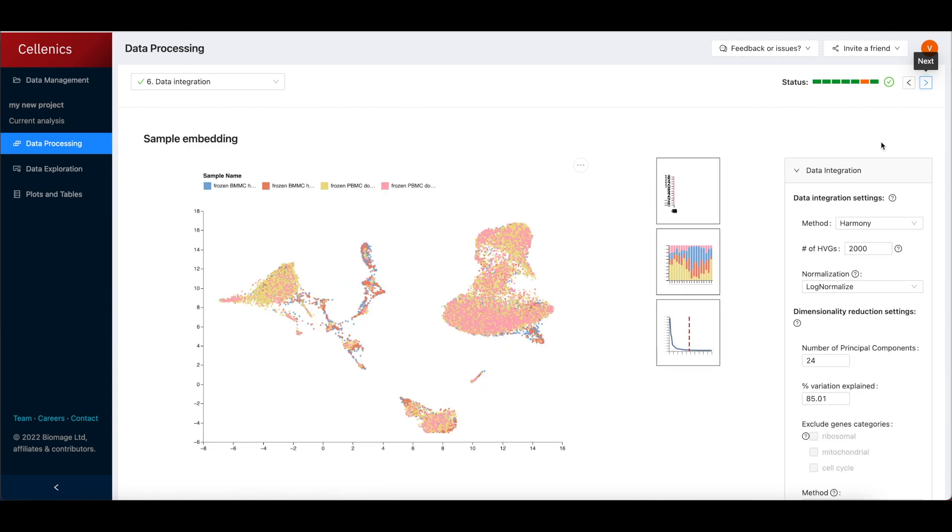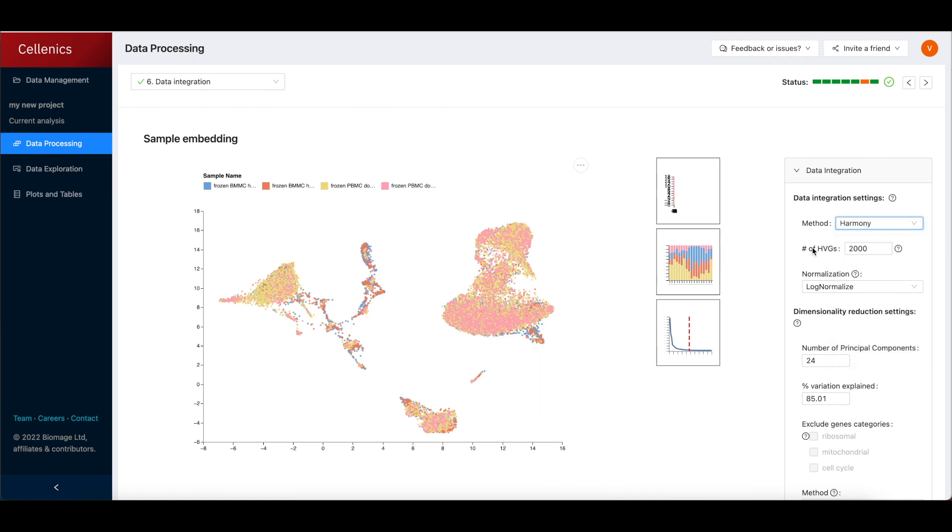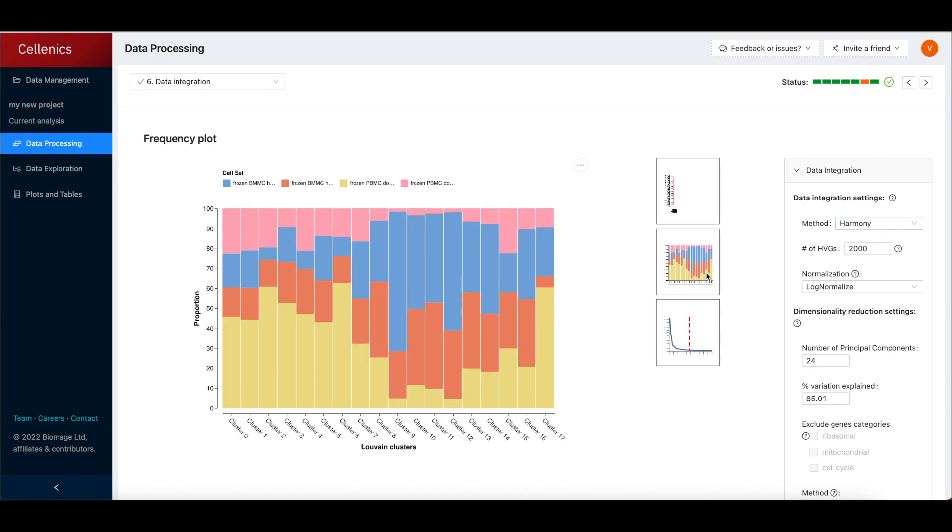Then, multi-sample datasets are integrated in step 6, either using the default Harmony method or alternative options such as Seurat or FastMNN.